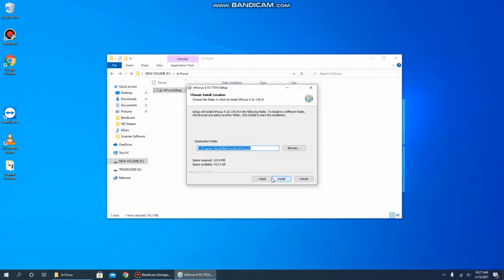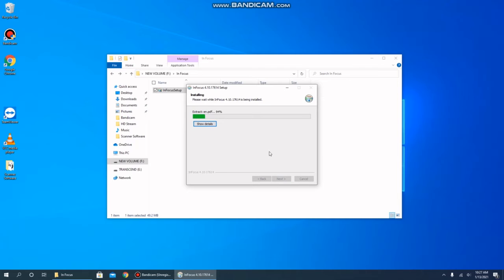Simply click Next, which will bring us to the destination folder. If you want to change it and put it in some other location, feel free to do so now, or leave it as default. Click Install and the process will begin and should take less than a minute.